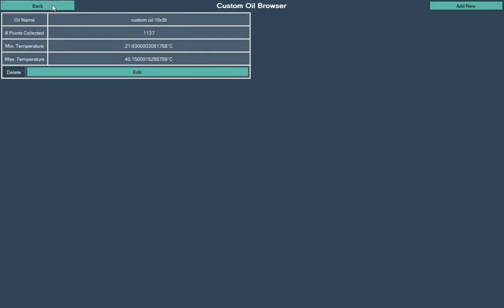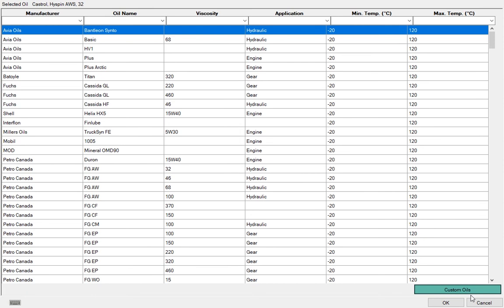But we will be covering that in another video, so do stay tuned. Now let's navigate back to the main page. To do so, click Cancel and back until you see the home page.